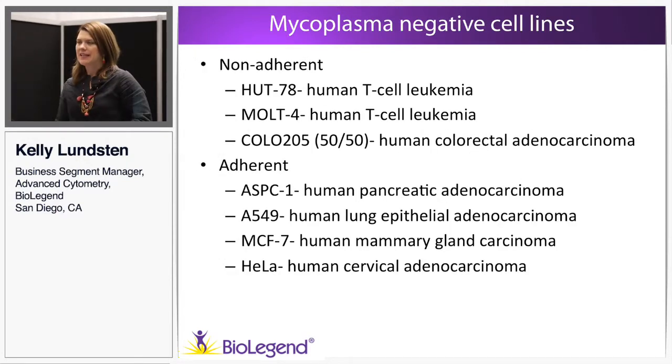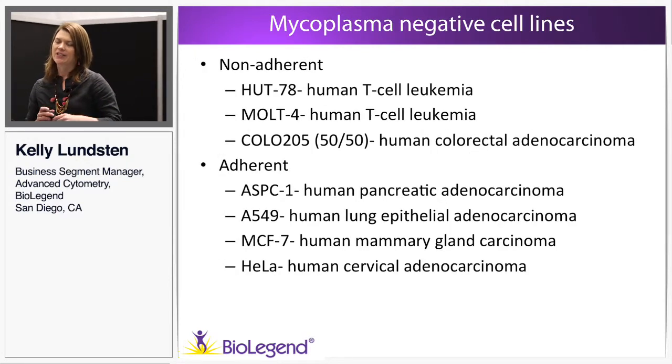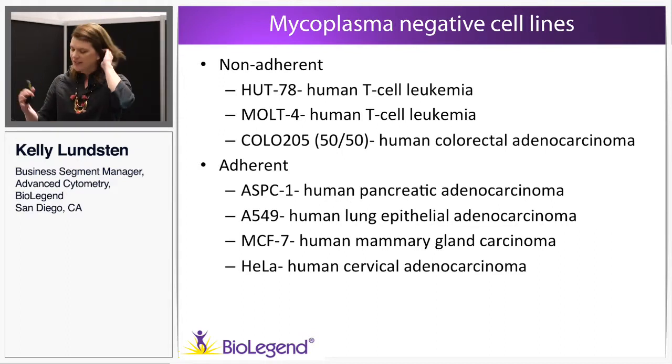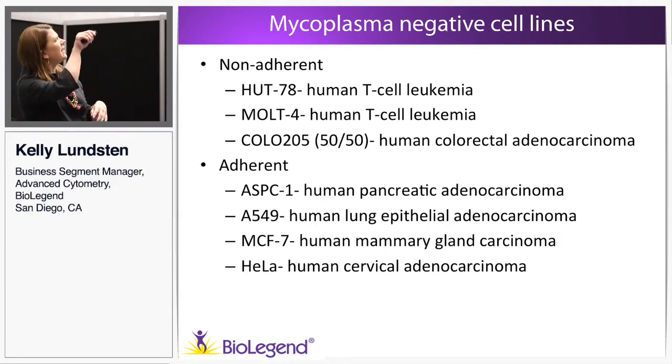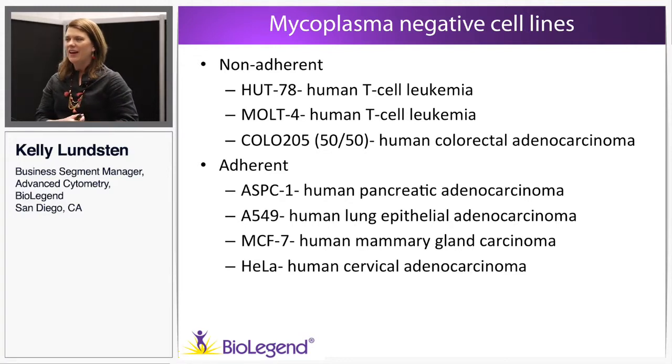All right, so these were the cell lines that I initially assessed. I just looked through our cell line bank and asked what would have the greatest biological diversity amongst them. And as I said, the HUT78 leukemia cell line ended up giving me by far the most hits to keep this project chugging for quite a while.